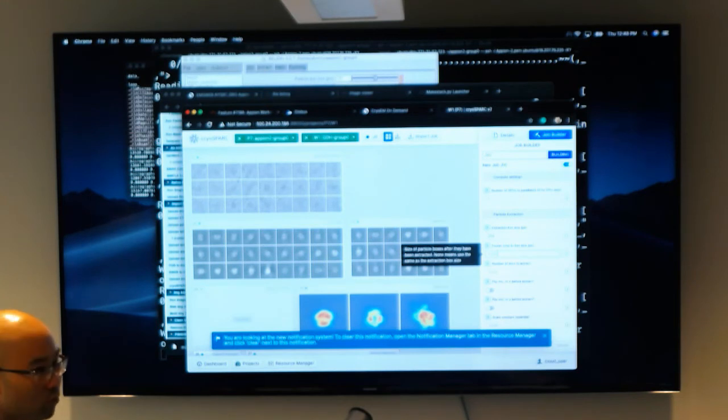A tight mask would be shaped based upon, let's say, a volume, and that would require you to have a volume. In that case, it's not just a sphere, it's actually a mask that is based upon your 3D model.